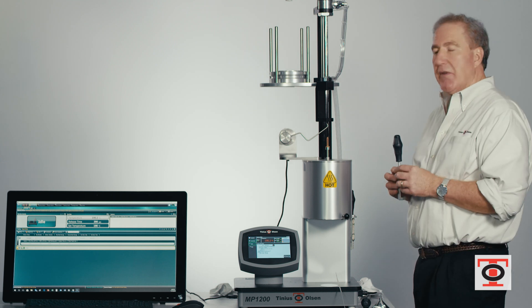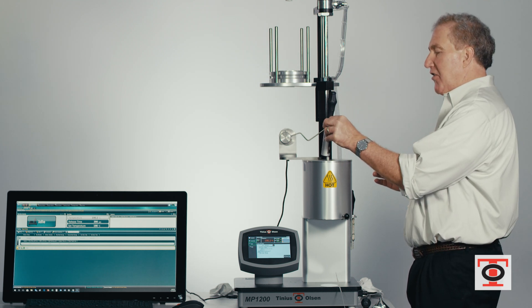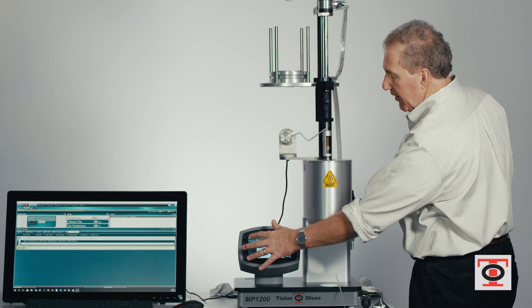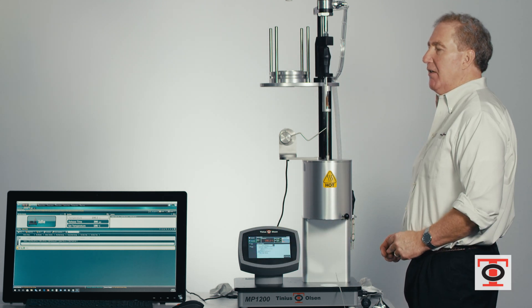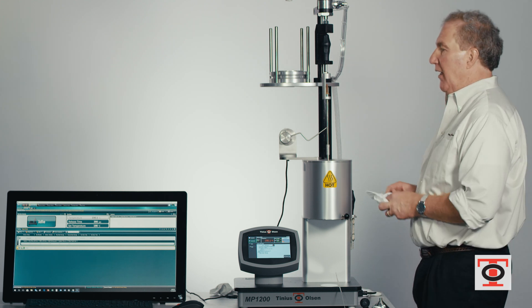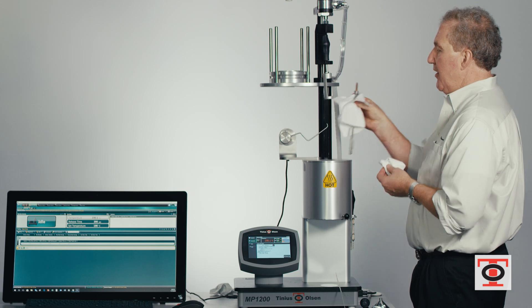That lowers the ram down so that I can put in the piston extraction tool. I position that, and then I hit the cleaning function again, which simply brings the piston out of the cylinder. It allows me to grab the piston.